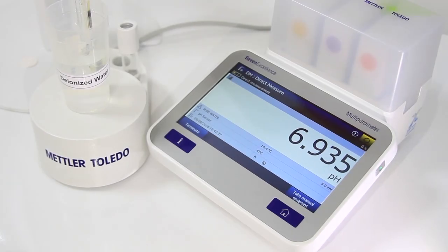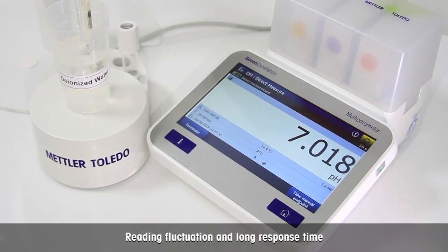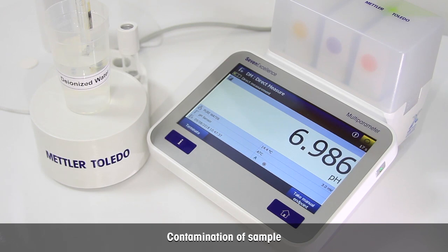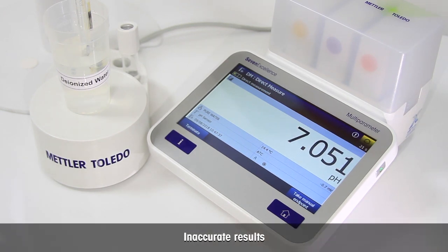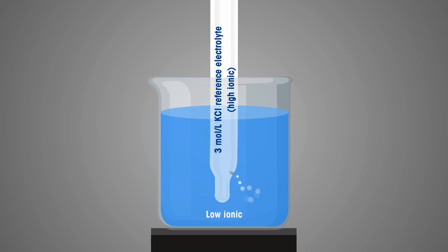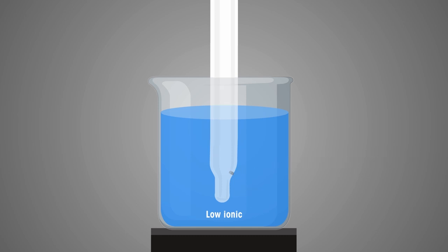It is important to note that measuring pH of pure water is not easy. There are three key challenges: first, reading fluctuation and long response time; second, contamination of the sample; third, inaccurate results. Pure water samples are low in both hydrogen ions and conducting ions. The low ionic concentration causes a large difference in ionic strength between the reference electrolyte and the sample, preventing a stable liquid junction potential and causing a long stabilization time.